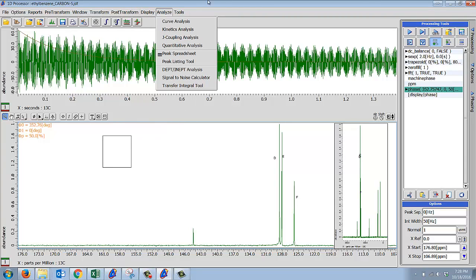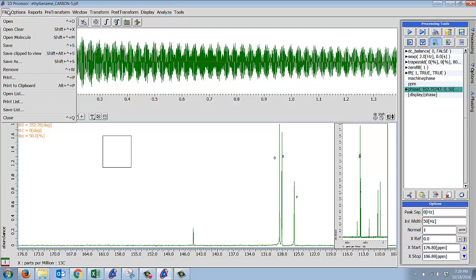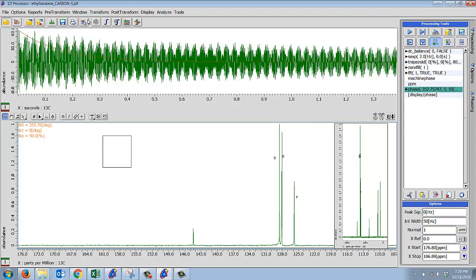If you needed to copy and paste, if you are on a Mac, that's usually who's using this version of the software, screen grab just that bottom part of your spectra is good, or if you wanted to actually save it as an image. So you need to probably play around with your options for saving your file a little bit more than other people if you have a Mac, because it's a little bit different.